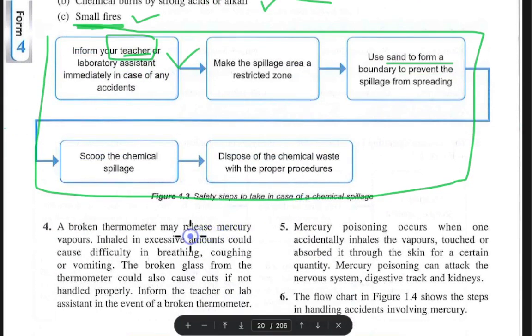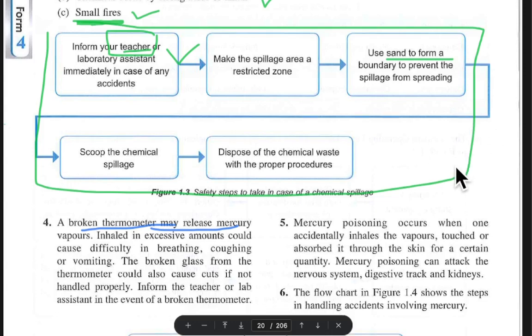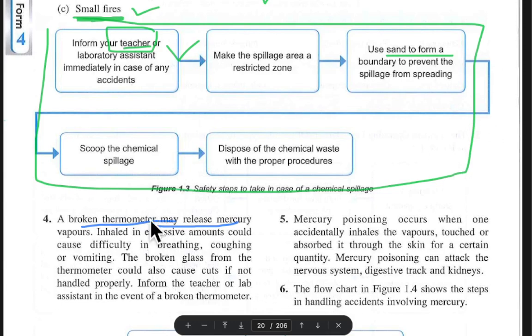So mercury, let's say there's a broken mercury. What should you do if there's mercury? Why is a broken thermometer dangerous? If I break this cup, it can also cut my hand, but not that dangerous. If a thermometer breaks and it cuts my hand, it is more dangerous. So why is this cup not that dangerous? Let's say this is a thermometer. Why is a thermometer more dangerous? Mercury. Yes, one of the reasons is that inside the thermometer there is mercury.